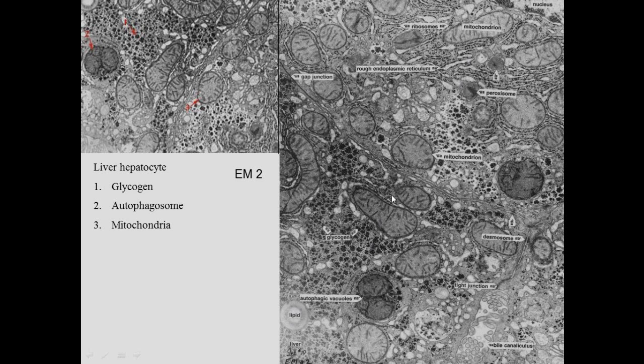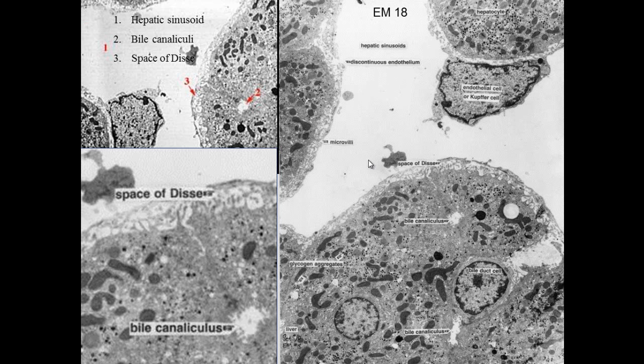I can't see it right now. Nucleus up here. And the smooth endoplasmic reticulum is associated with detoxification.